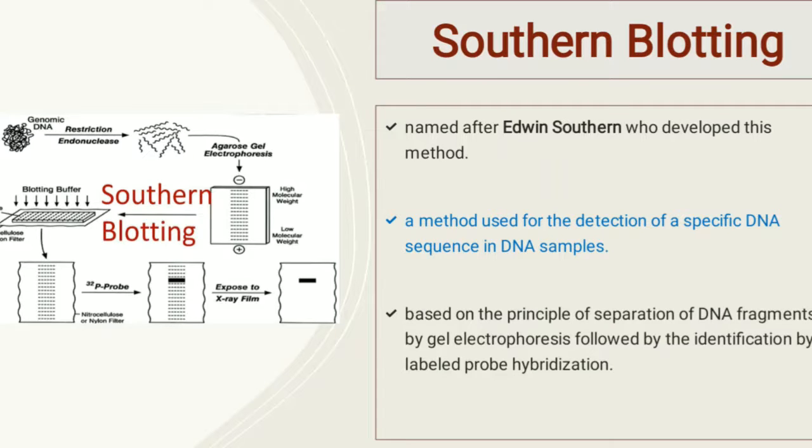So first of all, blotting buffer. You will place the blotting buffer in a beaker. Upon the blotting buffer in the beaker, you will place a sponge. The sponge will be placed in the blotting buffer. On top of the sponge, you will place the gel.